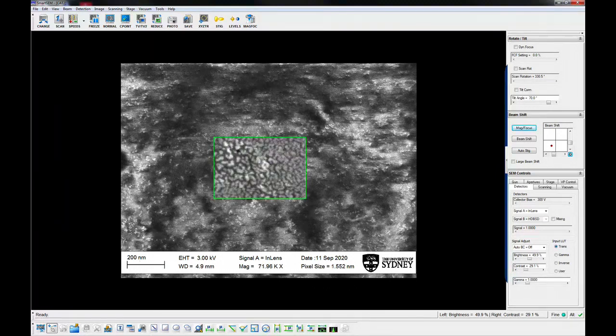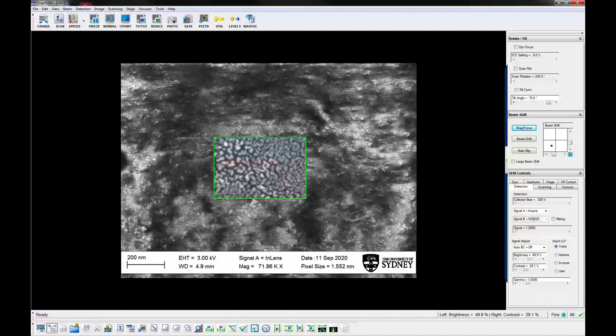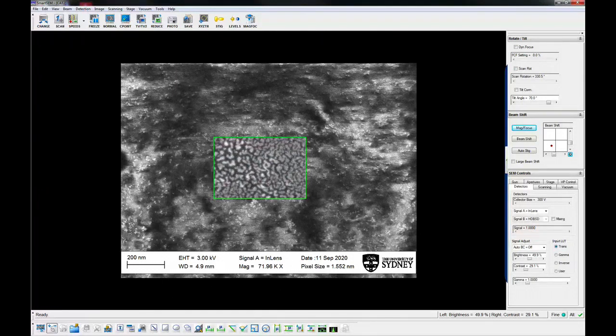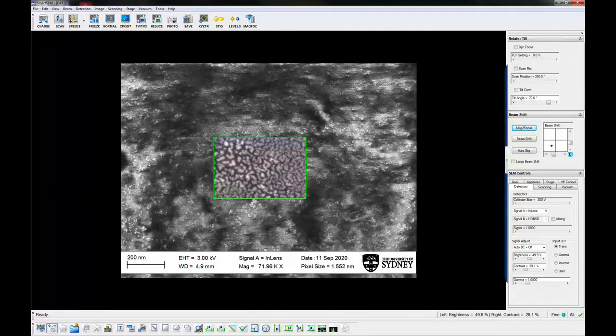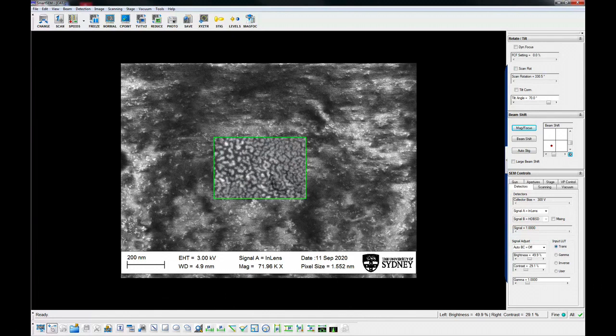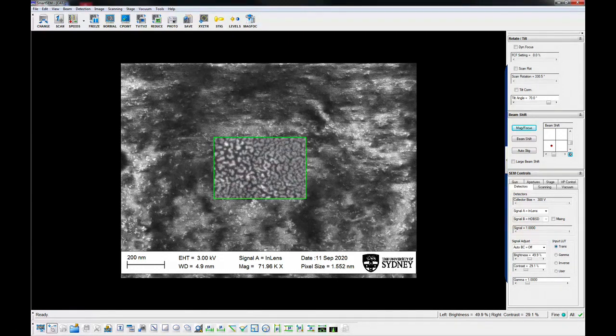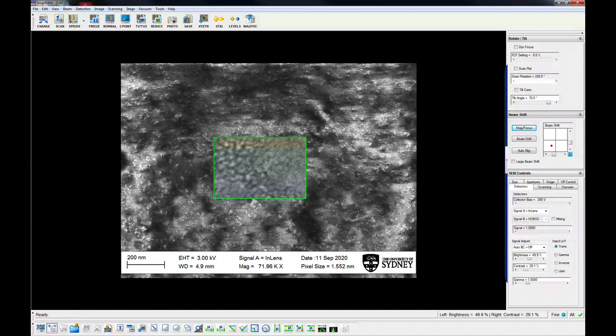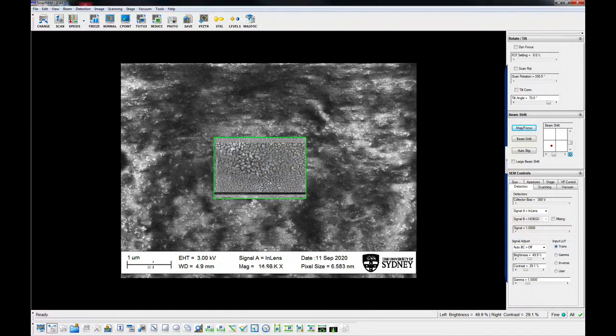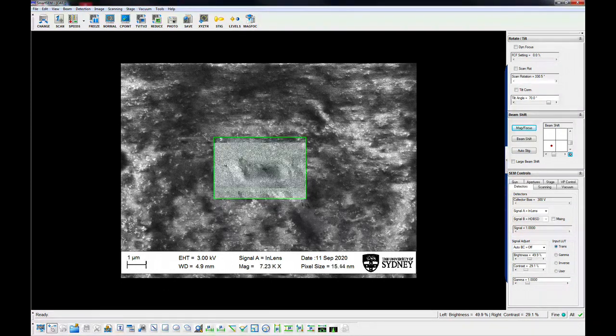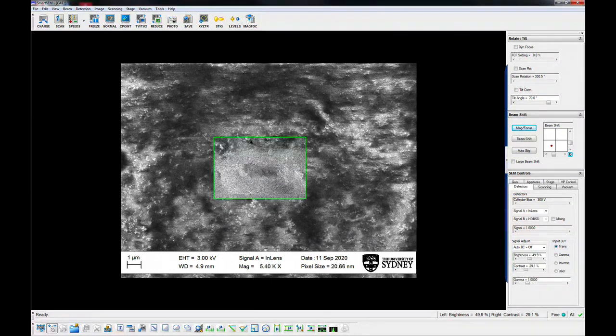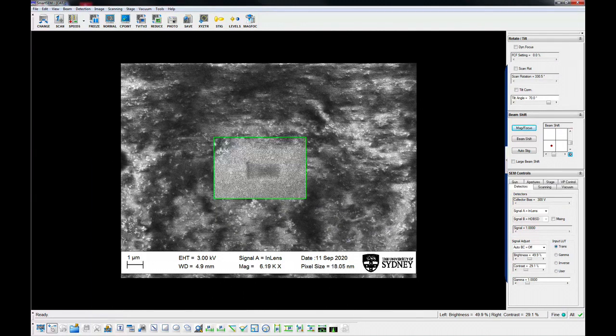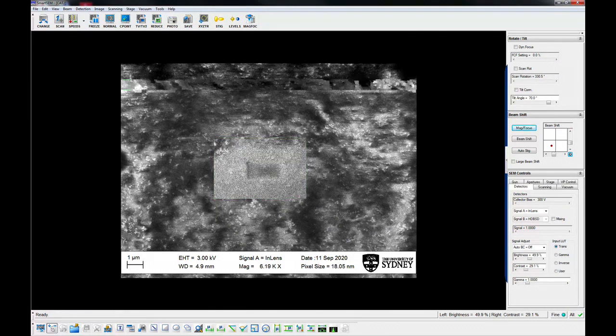To capture an image, focus and stigmate the image at about two times the magnification you want to capture the image. Set the brightness and contrast so that the features you are interested in have a good dynamic range. Set the scan conditions to reduce the image noise and to capture at the desired resolution.